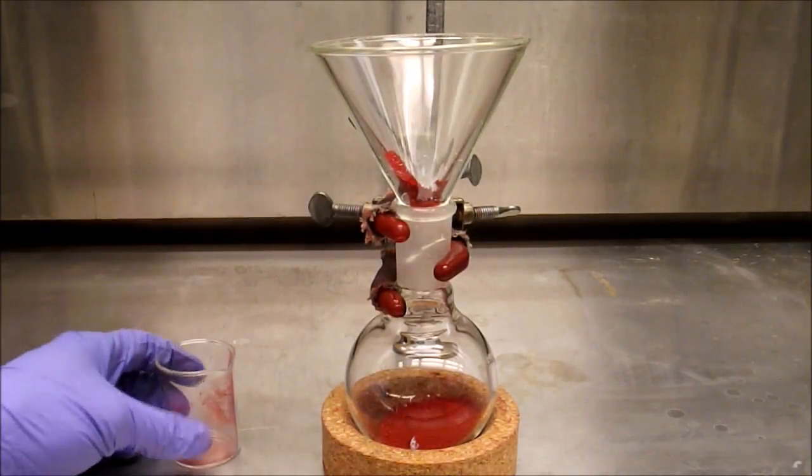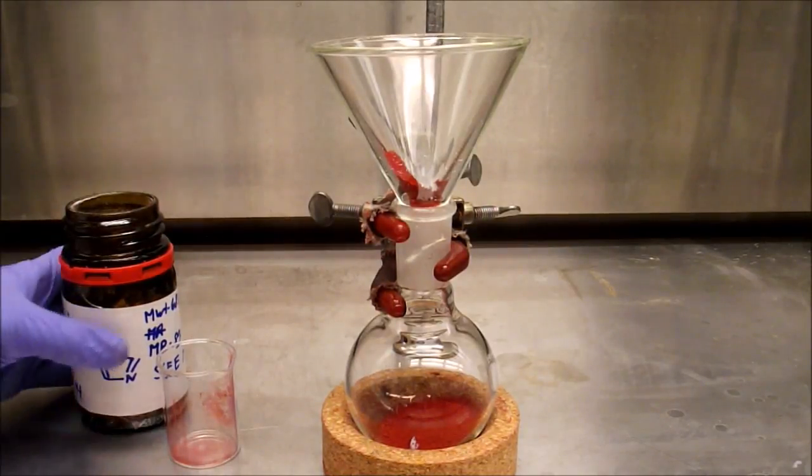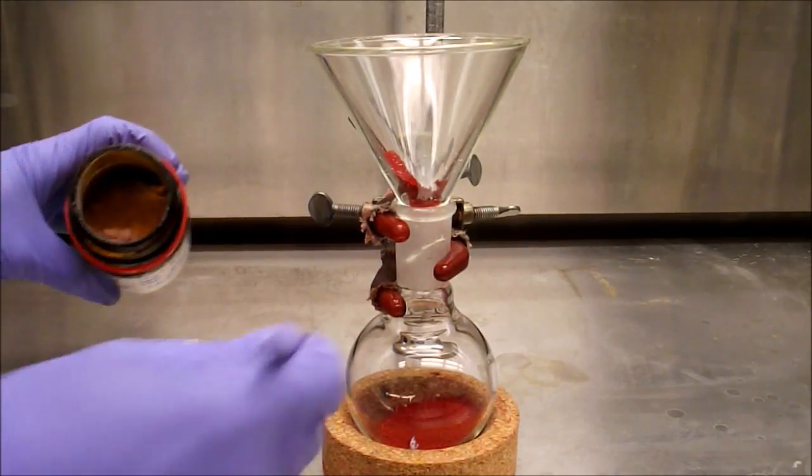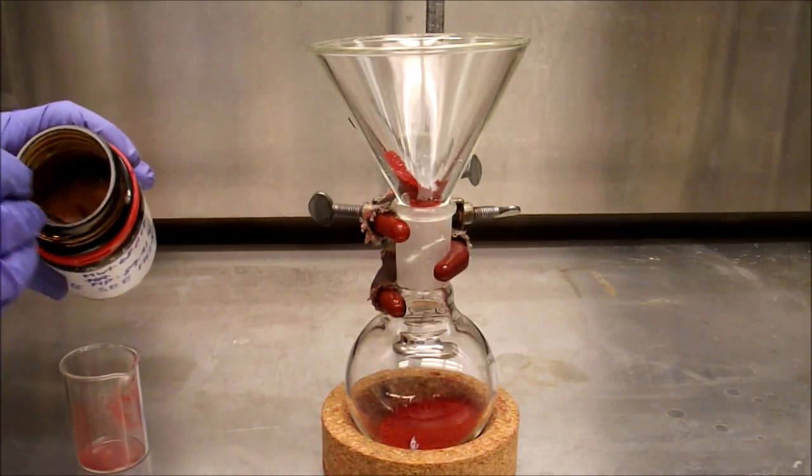Second, enough imidazole is added to the round bottom flask to half fill the flask. The imidazole is transferred using the same beaker as the perylene dianhydride to help ensure that all the perylene dianhydride has been transferred.